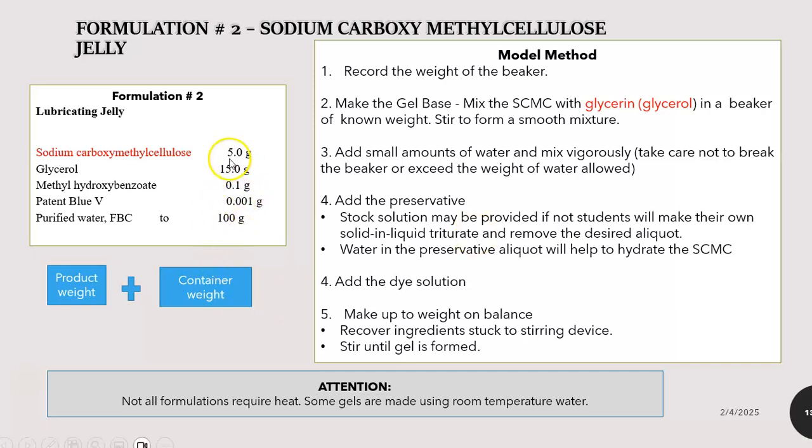Add it to the mixture containing everything, and you have to rinse to recover all the drug or the preservative from the beaker. That's if you did not make a triturate and you were dissolving it from scratch. Now, once you've added that to the base, you mix and allow it. Every time you add water, the CMC is going to actually swell some more and swell some more and thicken some more.